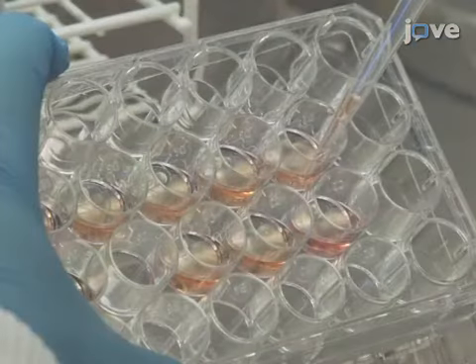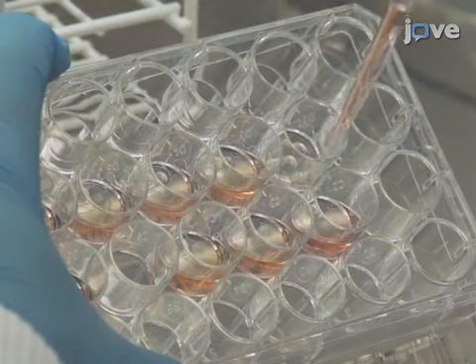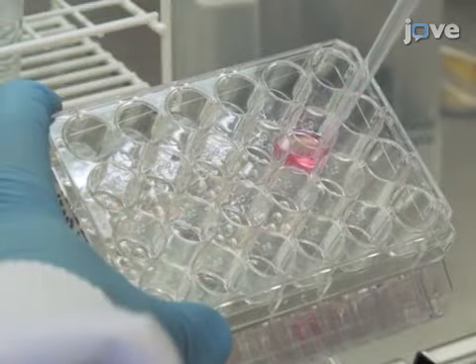Next, use a P1000 pipette to carefully aspirate the medium from the organoid culture wells without disturbing the basement membrane matrix drops and add 1 ml of basal medium to each well.